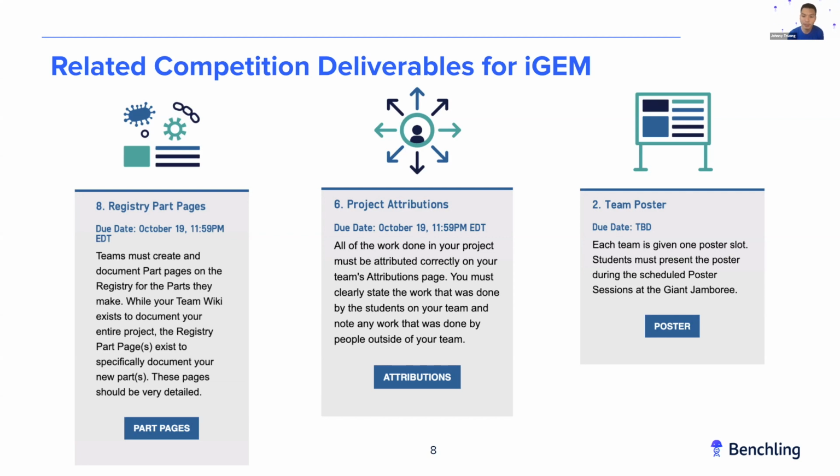And finally, the team poster you have to present can often have a lot of different information depending on what stage of the project you came into. So this can include experimental design and even maybe sequence information. So having the ability to really take images of plasmids or your DNA sequence can be super helpful while preparing your poster.